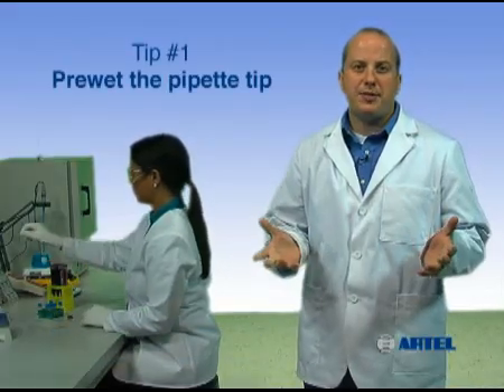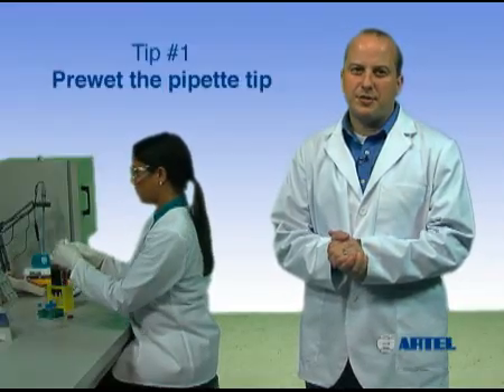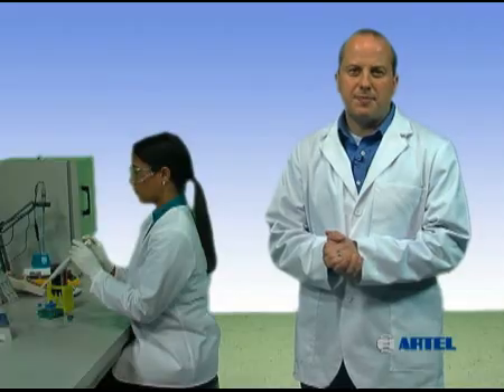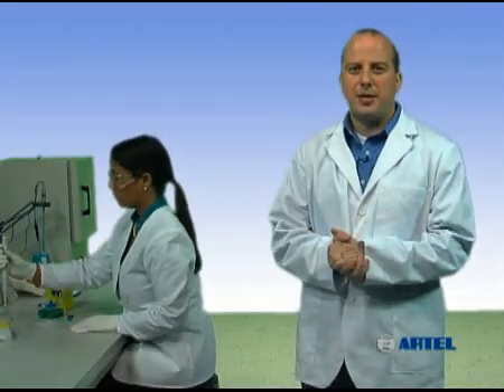Pre-wetting the pipet tip before you begin pipetting increases the humidity within the tip airspace. A humidified airspace will reduce the amount of sample loss due to evaporation. Evaporation within the tip may cause a significant loss of sample before delivery. Here is an example of pre-wetting a pipet tip.